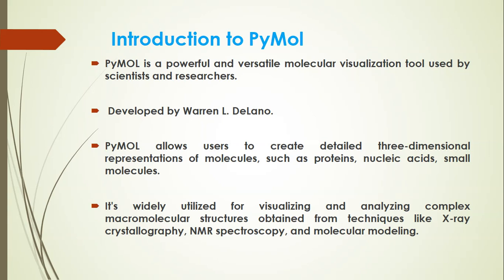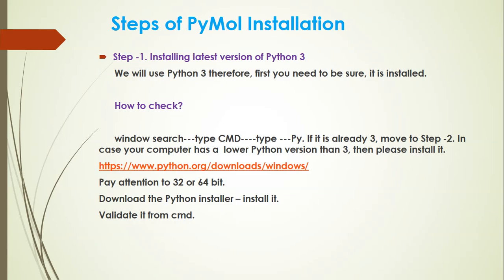Pymol installation is not straightforward, it is a bit technical, so I felt that I should give you a brief tutorial on how to install your Pymol software. First of all, we will do some downloading steps, and after that I will teach you how to install.